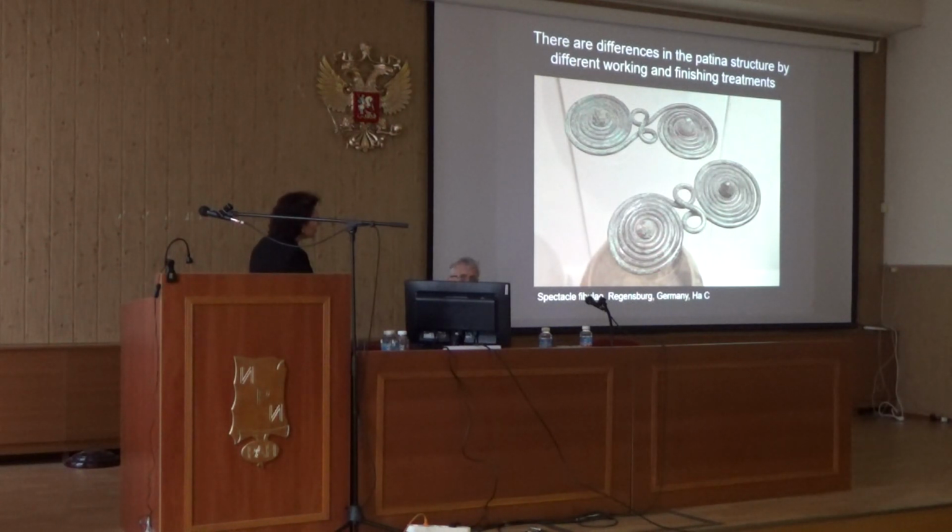Look at these rivets here, these here, these here, these here. The patina on them is very rough, very thick. So this kind of patina absorbs elements from the earth. So you suddenly have zinc, where there isn't any, you have iron, you have a lot of stuff which is not there really. And many elements are lost in the soil. This patina loses elements. You lose tin, you lose lead, of course, and so on.